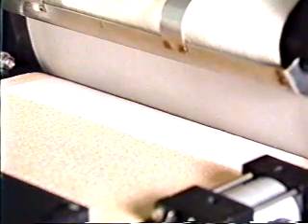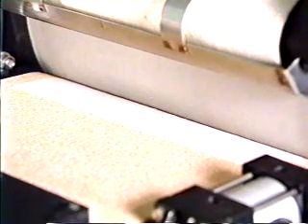A continuous sheet can be made by overlapping the edges of successive sheets. Multi-ply sheets can also be made.